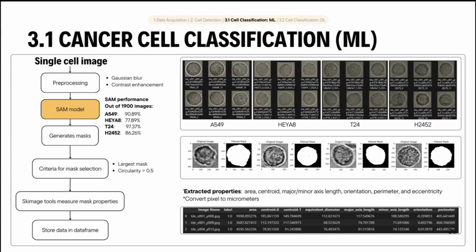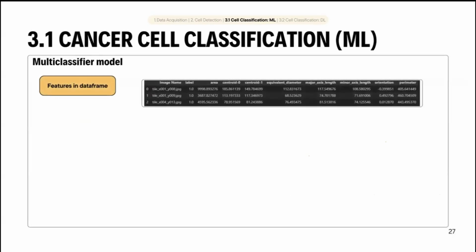And the features are loaded into different machine learning models with 4 label classes. And we also have Bayesian optimization to increase the accuracy by up to about 3%. And for the results, it shows the accuracy that the models have achieved. Okay. And yeah, next.